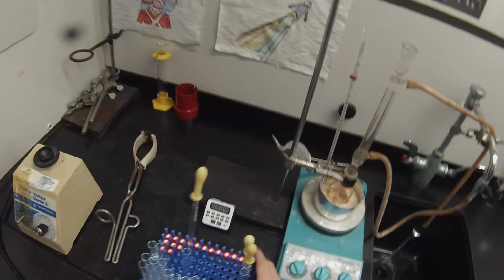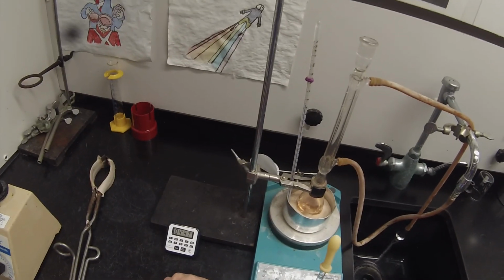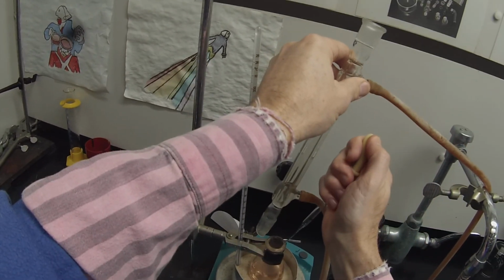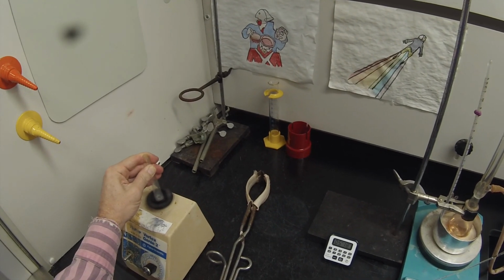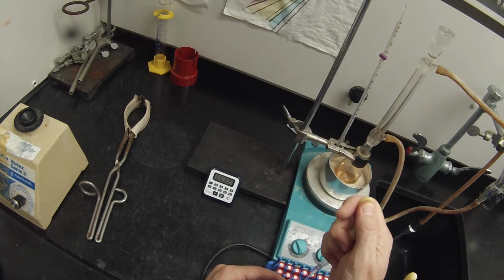So now we're waiting for our 5-minute data point. I'll move this over here so it's closer and easier to get to. Scoot that back just a little bit so this can be flat. So now we're looking for our 5-minute data point. 4 minutes and 58 seconds. That's a little too much. That'll work. Try to make sure I always get it in the right tube. Vortex that. Give this guy a rinse. Rinse that pipette out nicely with the waste.